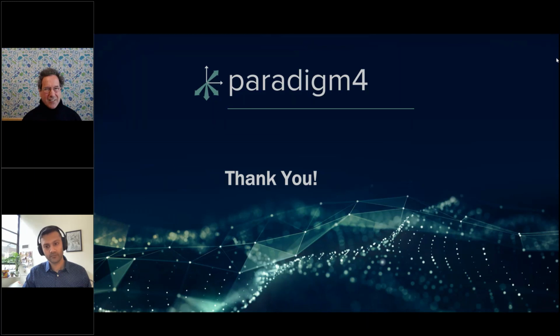So we're really designed to work with the HDF5 file format, and the metadata is really partly a question of how much do you want to decorate, but in terms of scale, there really is no limitation. Each one of those data cubes that I showed you can have millions of values inside of them. So it really is fit for purpose for this kind of scientific data.